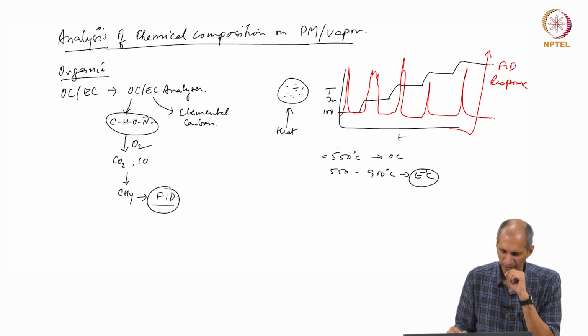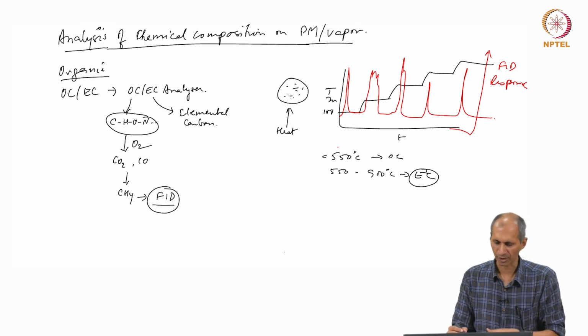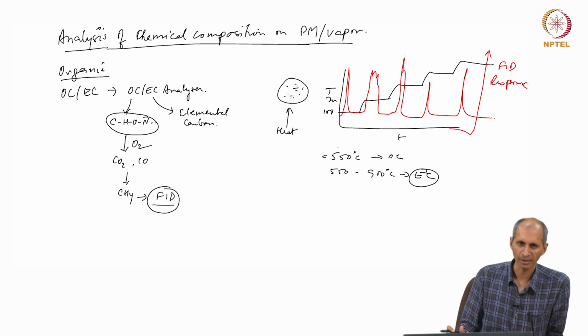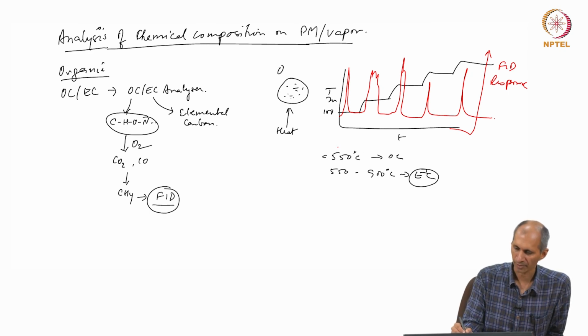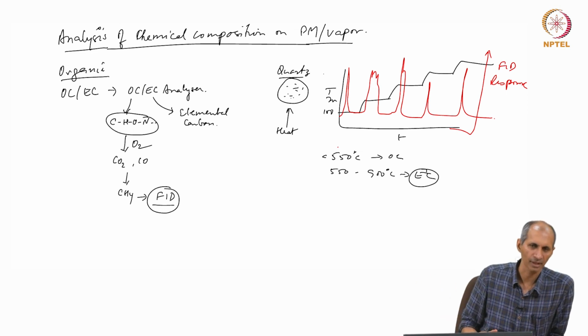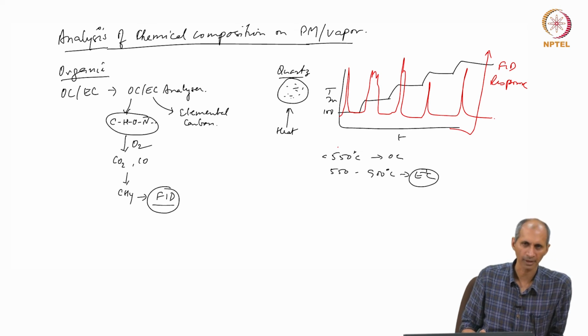So this is a very specialized instrument. Because this filter paper is directly put into the instrument and it has to withstand temperatures of up to 1000 degrees, we use quartz filter paper. We had mentioned in the previous class that we use quartz, Teflon, nylon, different materials. The quartz is specifically used for the organic carbon, elemental carbon analysis.